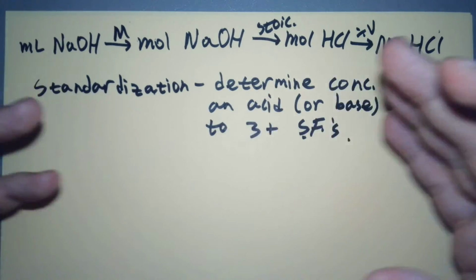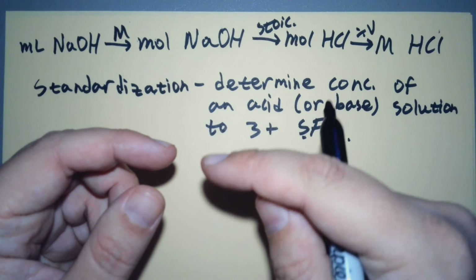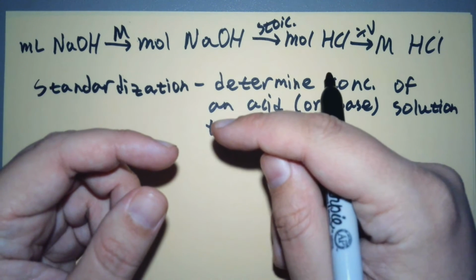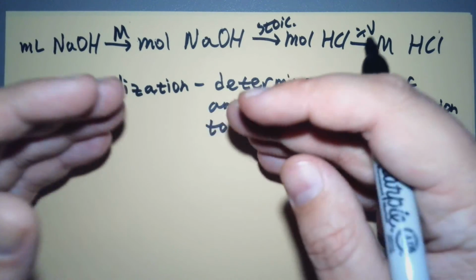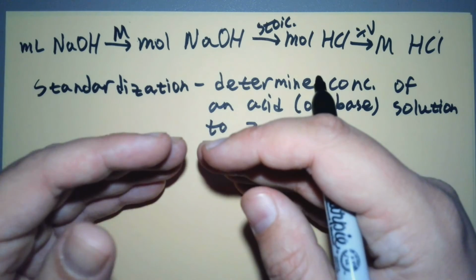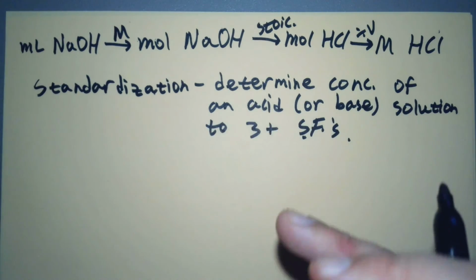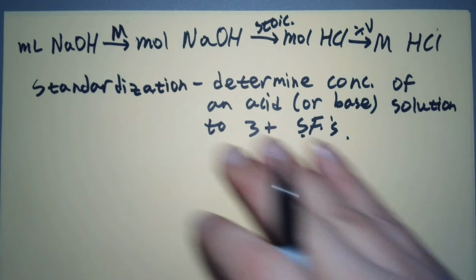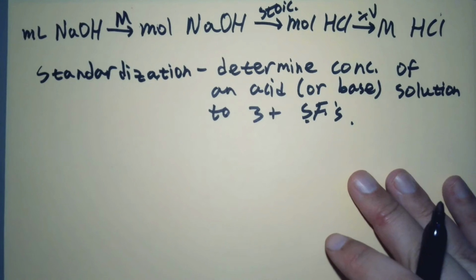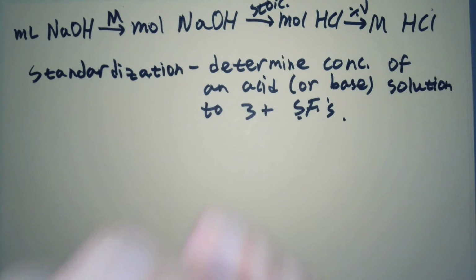It pulls moisture from the air, and if you watch the balance, you'll see the mass slowly ticking up even though you're not adding anything, because water is getting added onto that balance. And so it's impossible to know exactly what the concentration of NaOH is. Sometimes you can just use a balance and make a standardized solution, and that's great, but you can't do it with NaOH.